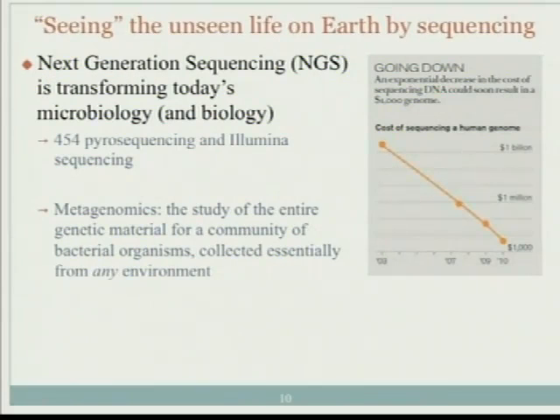But Illumina is just for shotgun metagenomics. I think Illumina is the main one. Even though for the human HMP project, the original proposal was to use 454 for the shotgun as well. But I think because the throughput of Illumina is a lot higher than 454, halfway through using 454, the whole HMP project switched to using Illumina sequencing for shotgun metagenomics.